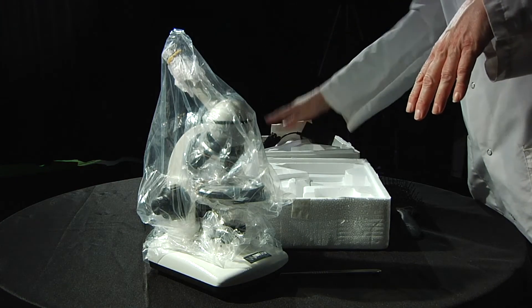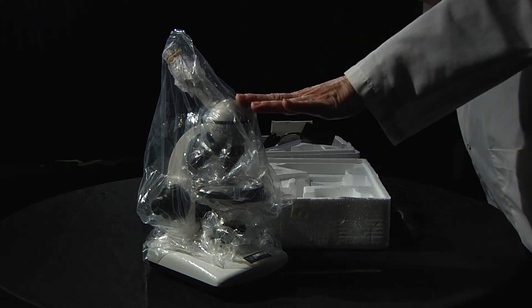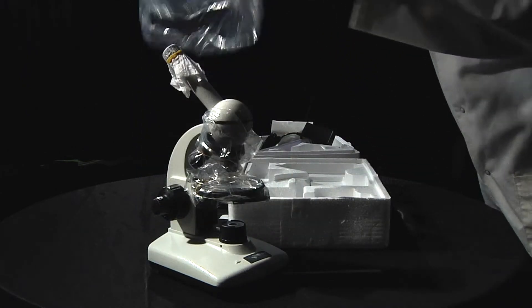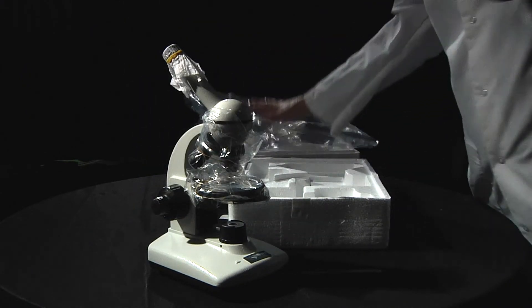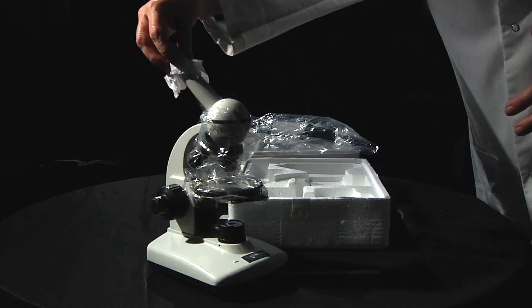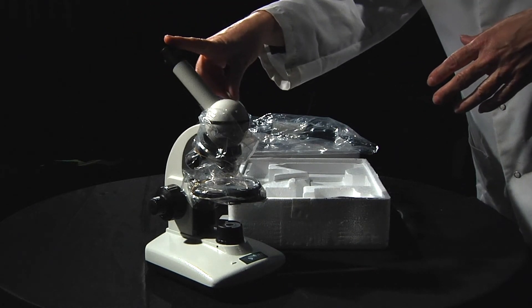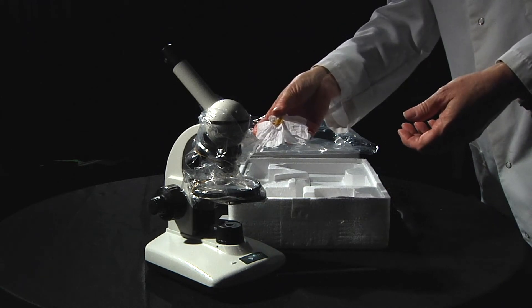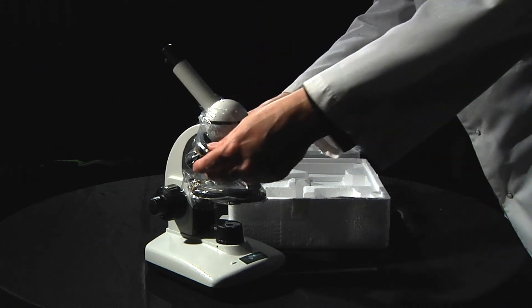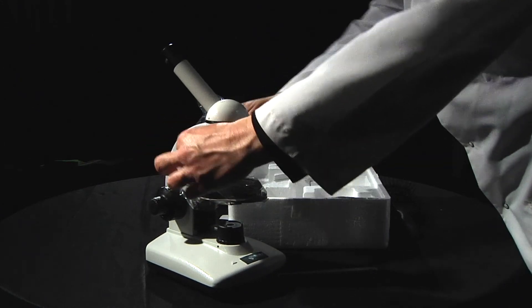For now I'm just going to put the charger aside, but you can unwrap that wire as soon as you want to. Here's the microscope — we just need to take off the plastic. Just do this very gently, and we're putting the plastic to the side because we want to keep it for later. Your microscope might have a cover with a rubber band on it over the ocular lens; you don't really need to keep this, but if you want to, that's also fine. Your microscope might also come with some plastic covering the lenses, and that can just be taken off and put aside.